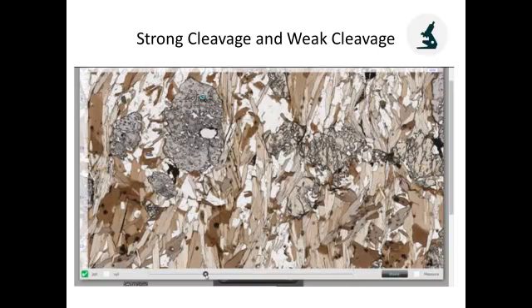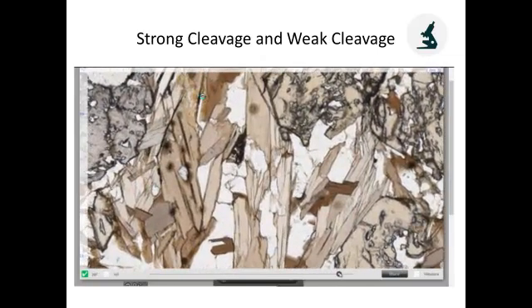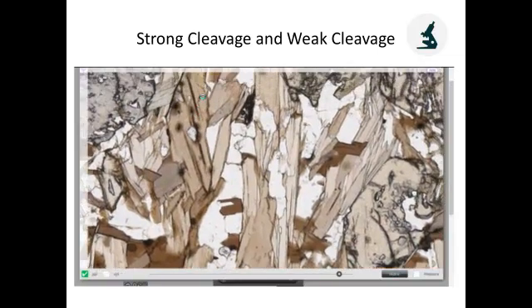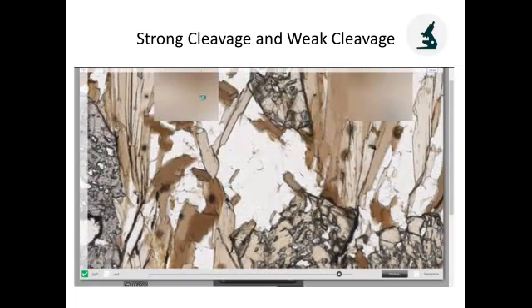Most of the vertical alignment here is biotite, and you can see cleavage in each of the biotite grains: straight lines parallel to the parallel sides of the biotite. The biotites are slightly different colours because they're pleochroic. We'll come to that in a different slide cast. But each of them, if you zoom right in, has these characteristic lines parallel to the sides.